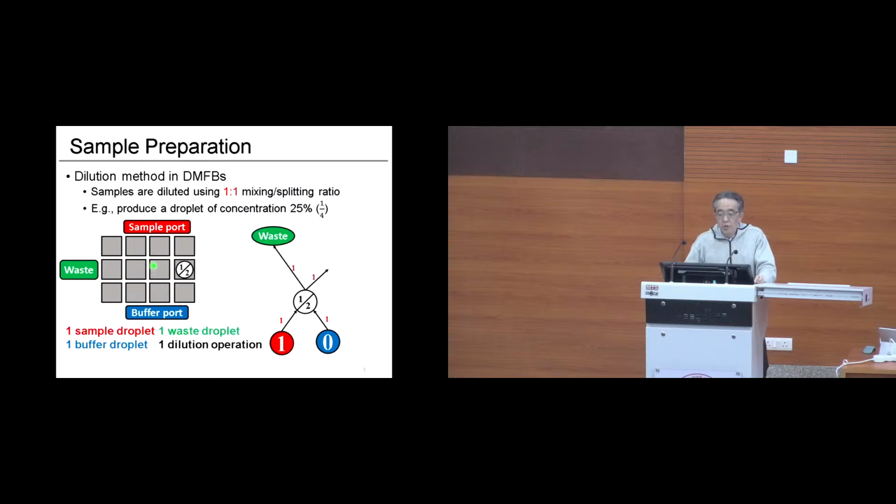So one of the droplets will go to the waste pot, and one remains in this device, for example. So in this case, the model of mixing is 1 by 1 mixing, and then the ratio of course becomes half, and we have 2 half-ratio droplets. And in this case, one is going to the waste pot, and one is still inside this device.